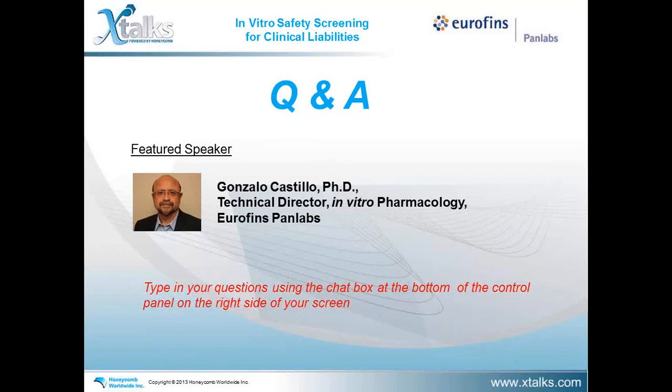One would be the guinea pig QTC. That would be the direct correlation to the hERG questions that have come up, and that's an assay that is very predictive and correlative to the development assays, as well as what you would see in the clinic for testing for QT prolongation. We also have a battery of rat telemetry tests that will measure other effects on heart rate, blood pressure, etc., as well as a respiratory battery.